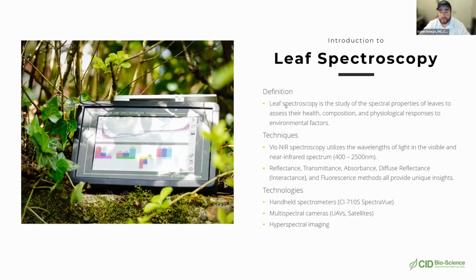The most important thing is your sampling plan, to make sure you're getting a robust idea of the actual ground truth of your specific plots. So come up with a really robust sampling plan and make sure you're collecting enough samples from different plants.